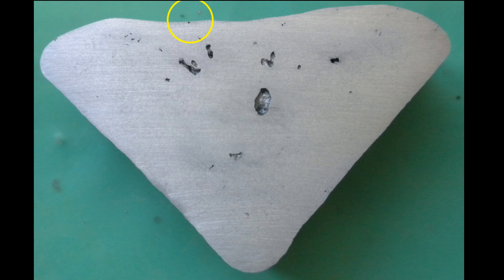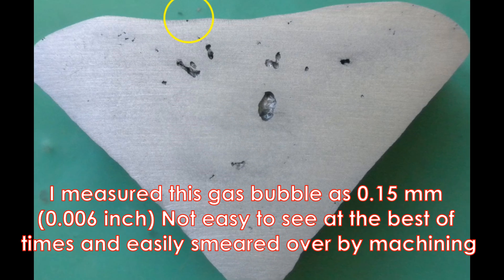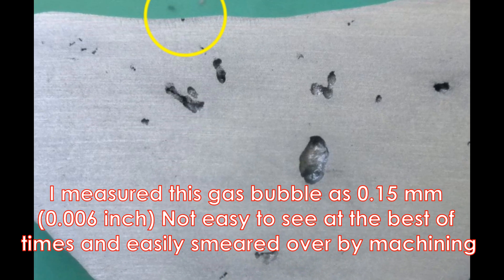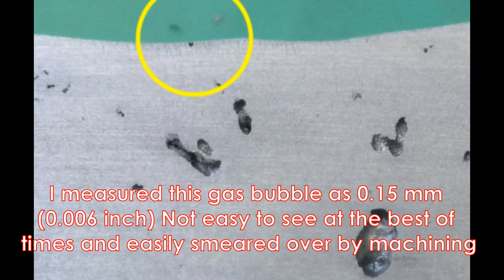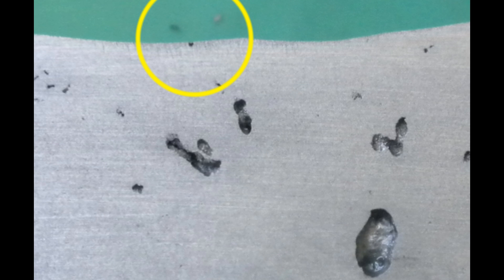Let's have another close-up. Keep your eye on the yellow circle as we zoom in here. It surrounds one of the very few pieces of genuine gas porosity in this sample. This small gas bubble lacked the strength to break through the oxide skin and is in fact caught underneath it. The remainder of the porosity in this sample is in fact quite gross shrinkage typical of a short freezing range alloy like this.